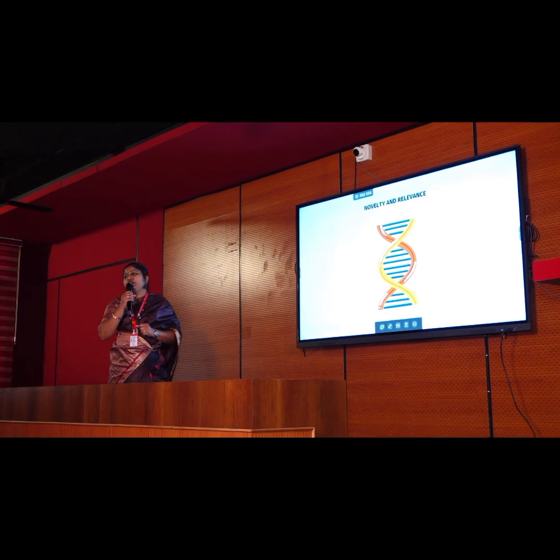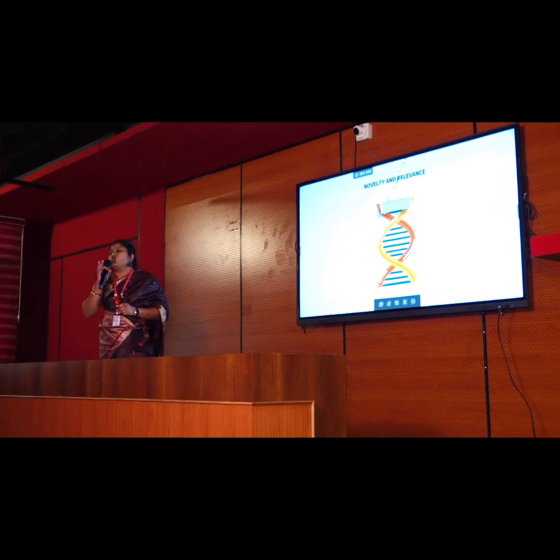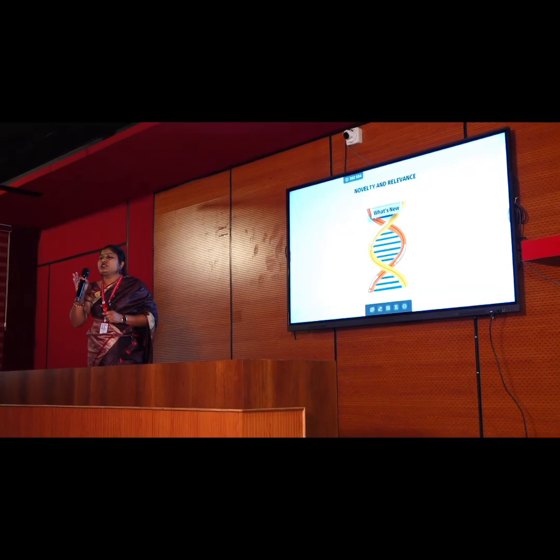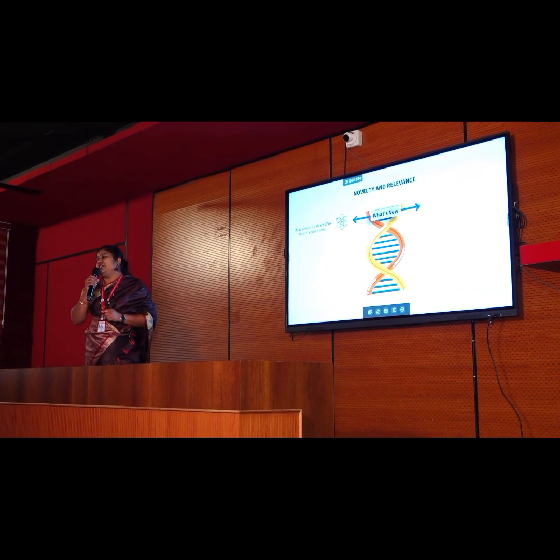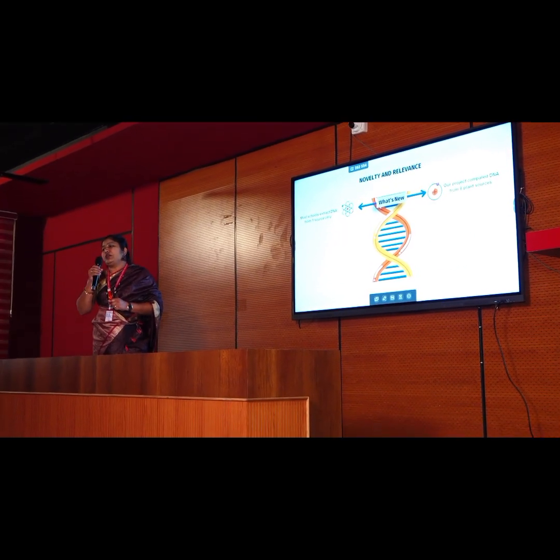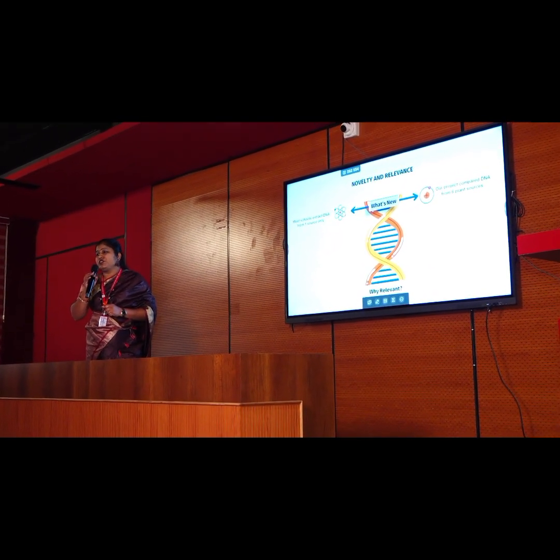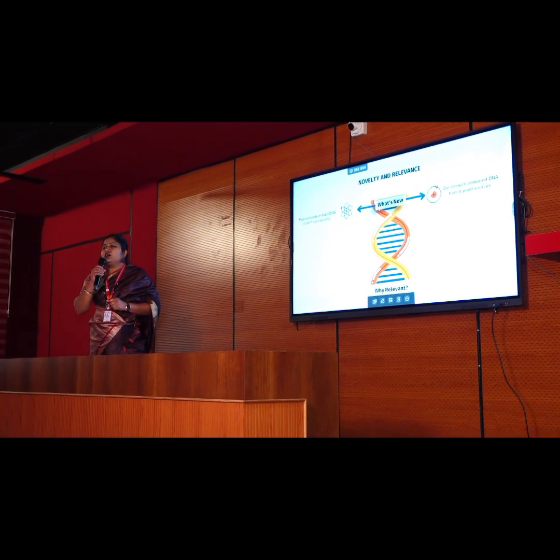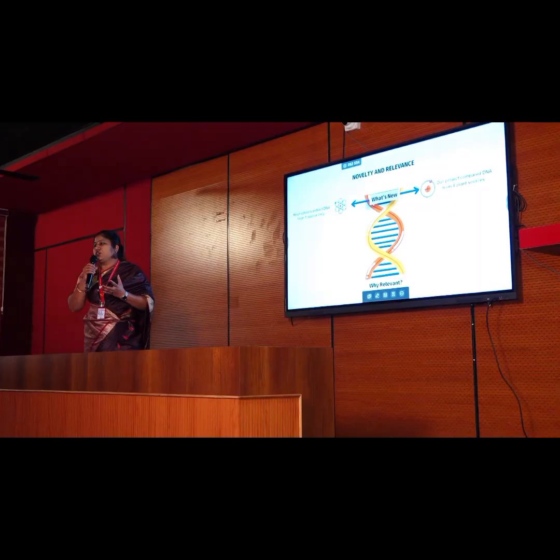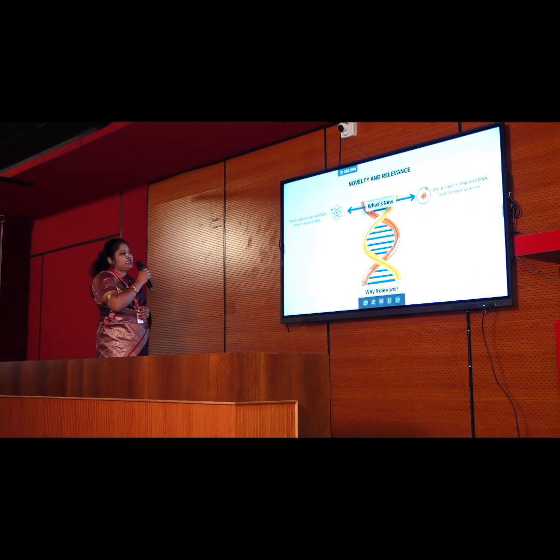Novelty. So what was the novelty? Maybe I told you we have extracted DNA. The newness I have added is that it is not from a single sample, but I have given them 8 samples in total, where they can easily compare what amount of DNA can be extracted from each different sample. In some samples they got low amounts, especially the orange and marigold flowers which I have taken, which gave very low concentration of DNA. The others gave DNA which could be visible to us. That quantity or concentration of DNA was available on the slides.